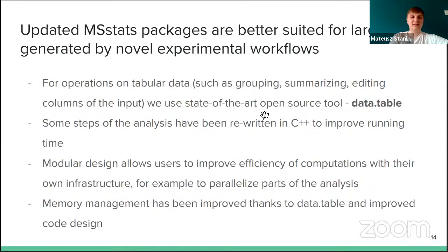So that part is well implemented now. Some steps of the analysis were rewritten in C++ to improve the running time. Also, the modular design will work to reduce the total time spent on the analysis. First of all, by letting us save some intermediate steps.